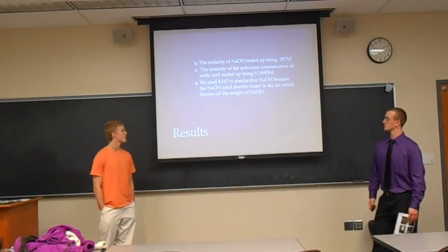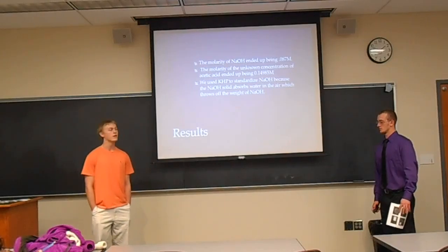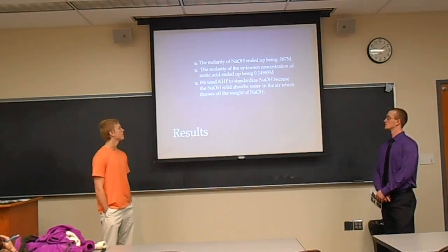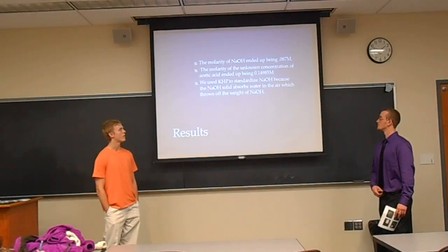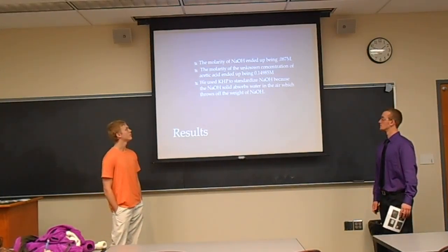Alright, and then our results. The molarity of the NaOH ended up being at about 0.087 molarity. The unknown concentration of acetic acid ended up being at about 0.149 or 0.15, depending on how you round it, molarity.